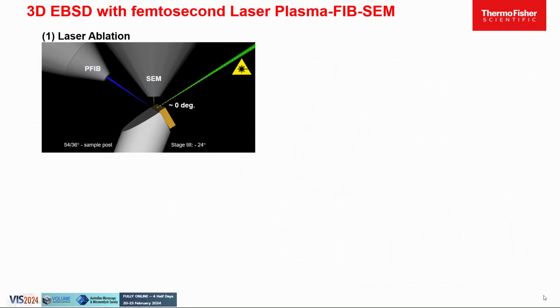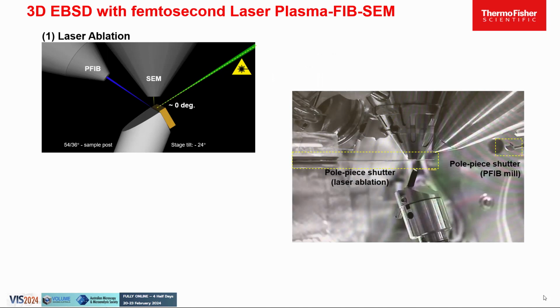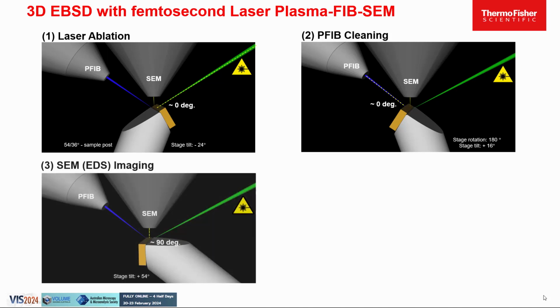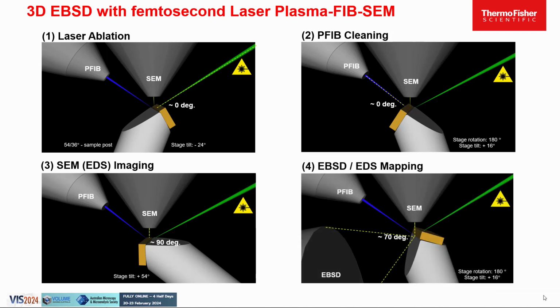Here is the laser ablation configuration and several control parameters in the UI. These are automated shutters. Here is the PFIB cleaning configuration. SEM EDS imaging configuration. And EBSD EDS mapping configuration.